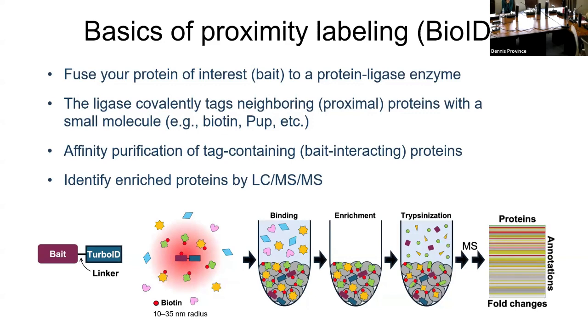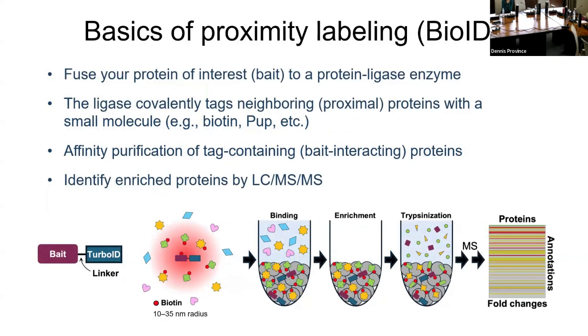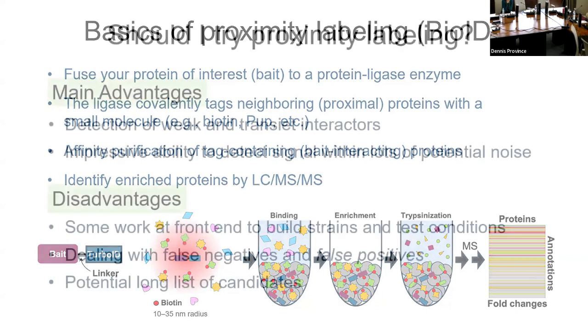No, you get enriched peptides because they came with your pull down. And then what I'll talk almost the most about really is this next thing here, which is really my efforts to stare at the data for thousands, or probably close to thousands of hours, trying to figure out what it meant and how to filter it out and what's good and what's garbage and that sort of thing.